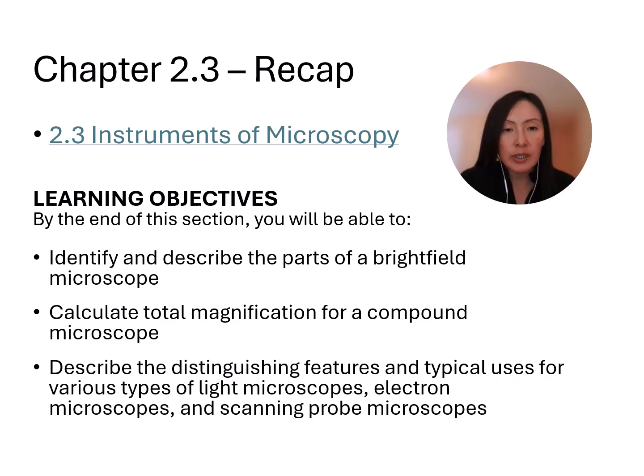For the third one, looking at the different types of light microscopes, electron microscopes, and scanning probe microscopes. Light microscopes, we had the bright field microscope, dark field, phase contrast, fluorescence, confocal. And I didn't talk about differential interference contrast or two photons, so don't worry about those details. If you're interested, we can talk separately on this. We also had electron microscopes, which are more powerful because electrons have shorter wavelengths. And then those scanning probe microscopes that have atomic level views.